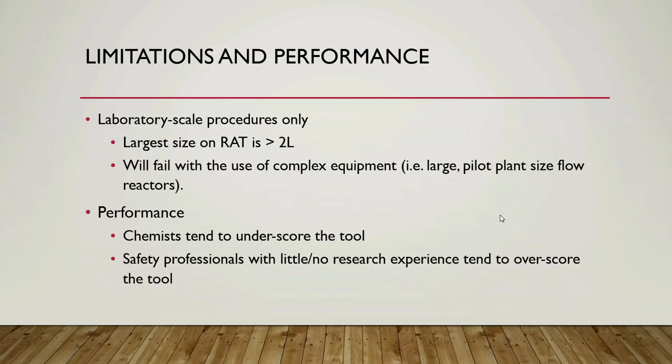All risk assessment methods have their limitations, and the LabRat is no exception. The LabRat was designed for laboratory scale procedures only, usually less than 2 liters in size. Currently, there is no evaluation for the use of process logic controllers. Consequently, the LabRat tends to break down with the use of complex equipment such as large PLC-controlled pilot plants or flow reactors. With over 40 person-years of use of the LabRat, some observations can be made to its performance.